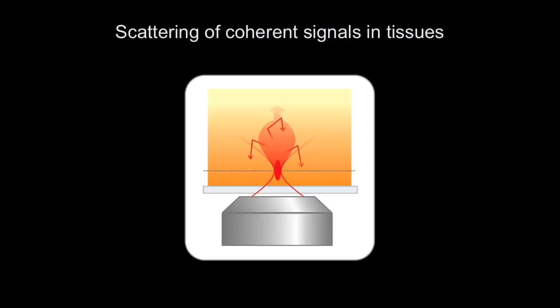That's the direction in which it constructively interferes. But then, due to scattering, part of that forward propagating light is back directed into the epi direction, the backward direction, and that's the light you intercept. So, if it wasn't for scattering, you wouldn't see anything. Okay? Scattering in this case actually helps us out. We need it to do this coherent type of spectroscopy, coherent type of microscopy.